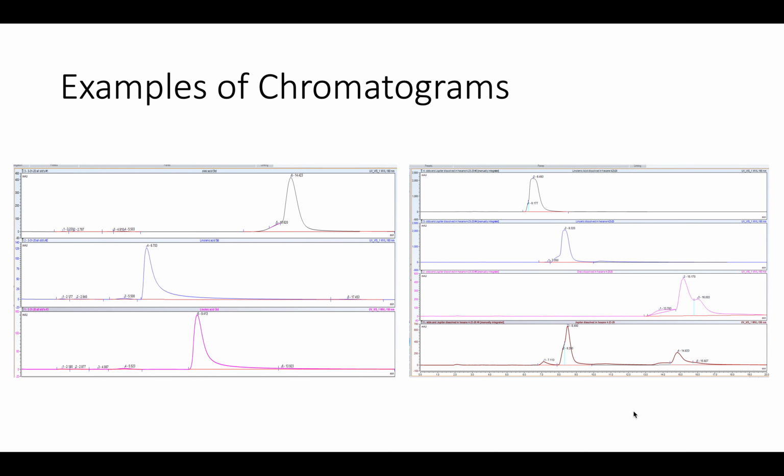Okay, and these are just some examples of chromatograms that we have actually obtained. The first chromatogram shows our fatty acid standards dissolved in acetonitrile. This did give us good peaks, but we had to dissolve the standards in a nonpolar solvent because the peaks were not showing up well when we ran our actual rice bran oil samples that were dissolved in acetonitrile also. The sample was exiting the column too quickly before it could be detected because of how polar the acetonitrile is.